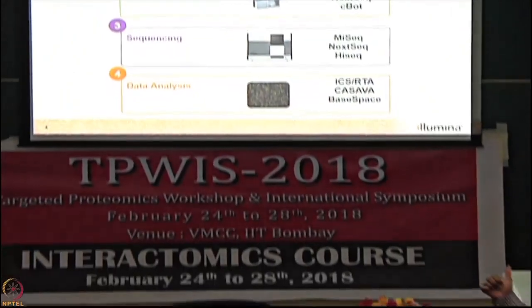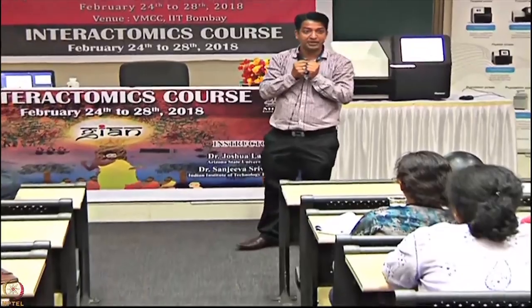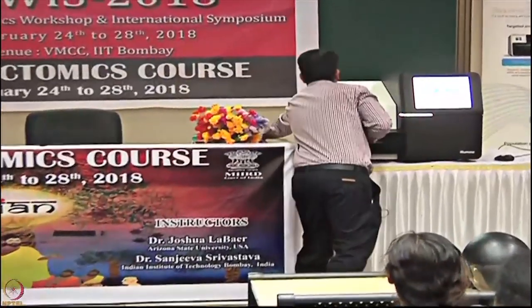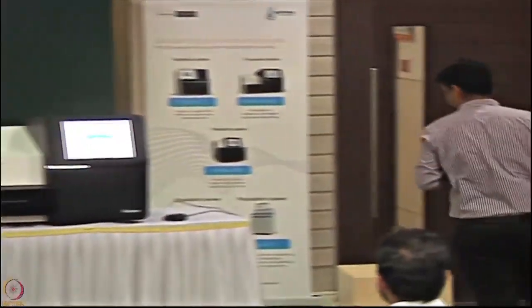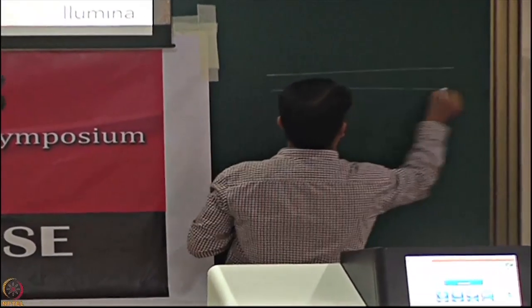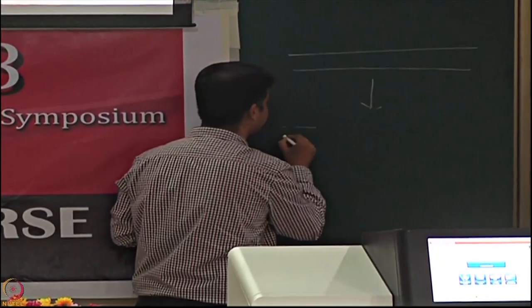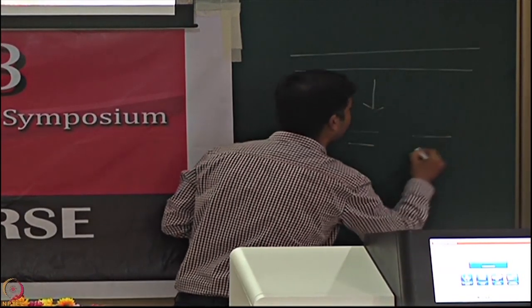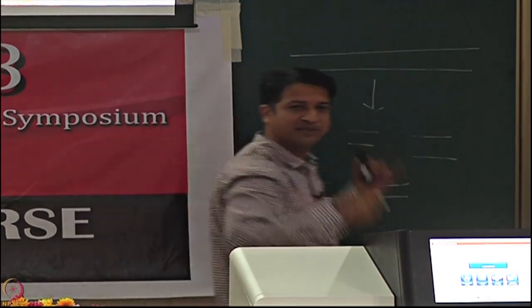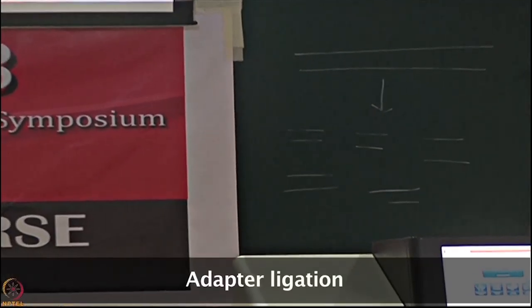In the case of NGS, what do we do? We chop down the entire human genome into smaller fragments. But those are unknown, right? Correct. What will you do? Let's see, this is the human genome. In Sanger, for any genome, human genome, big genes, initially the first step is we fragment it into various small fragments. Let's say of the human genome, 600 base pair, we'll chop it down into millions of fragments. But these are unknown. So to get them sequenced, what do we need?